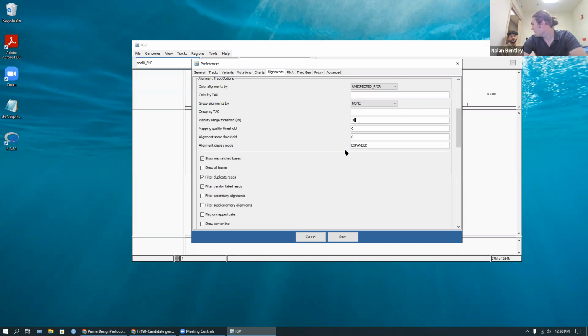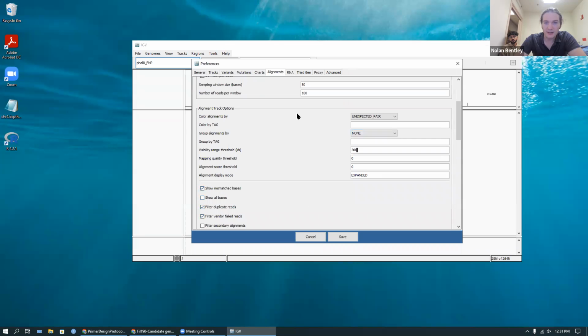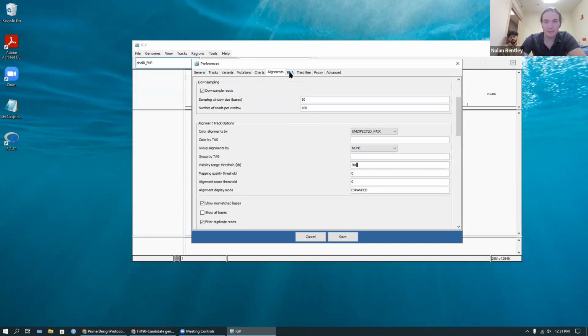It really depends on your computer. I think I've visualized about 5 megabase, and it would take a couple of minutes to render each time. I don't recommend getting that large, but you can certainly bump that up a little bit. So right now that's 300 kilobase. If I do that, that's 3000. So that's 3 megabase. That's probably a bit much. I'm just going to leave it at 300. I haven't really played a whole lot with the other settings, but I'm going to move forward.